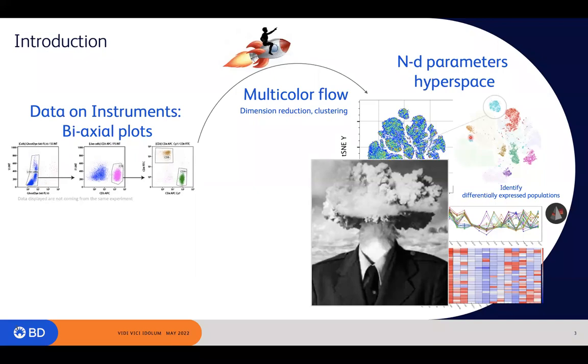Once we invoke these tools, however, we may find cells of interest that are popping up, that are driving, let's say, the hypothesis, or driving the phenotype that we are observing. And then it becomes a problem of, okay, I've identified these cells, but how do I now sort these cells, especially if they've been algorithmically determined, right?